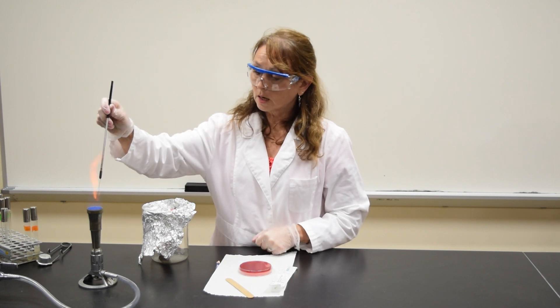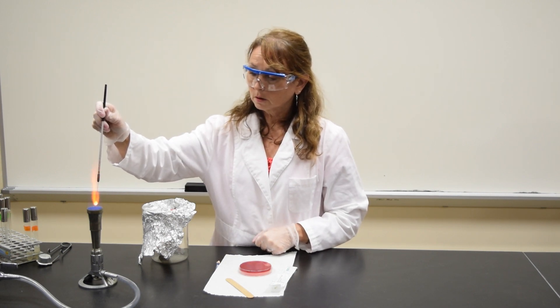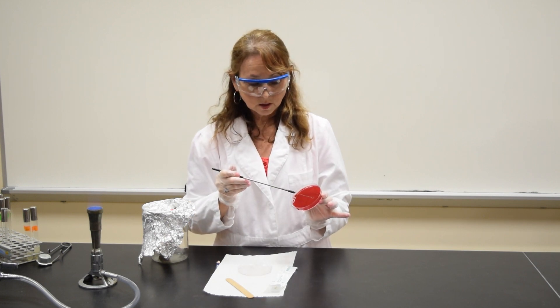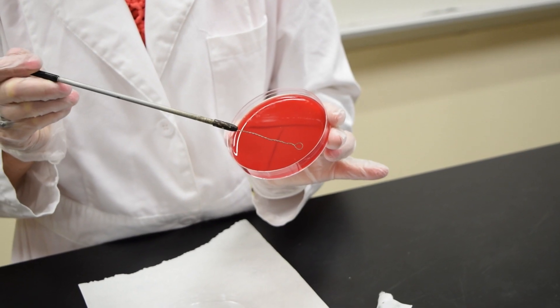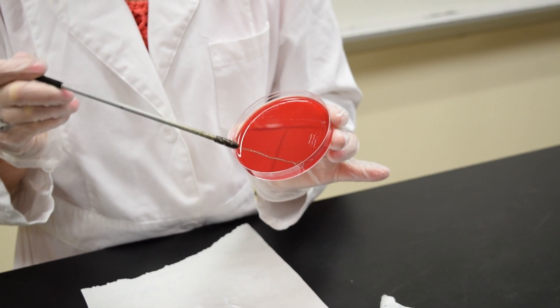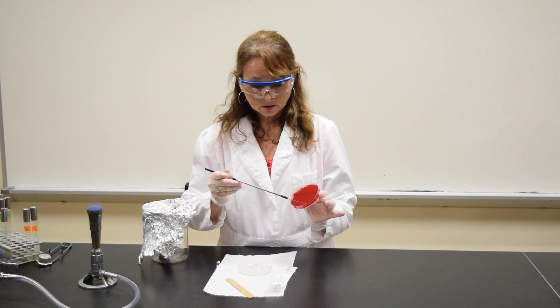Using your inoculating loop, you need to sterilize it. Touch area two, the area to the right of the letter T. Go into area one once, pull it out, streak, and stop at the line.